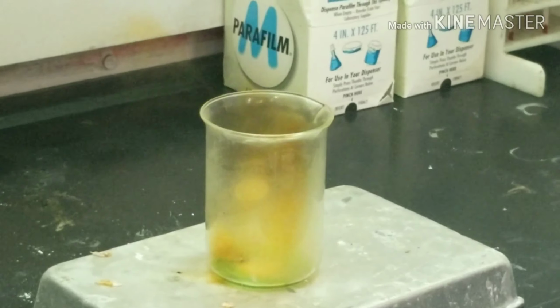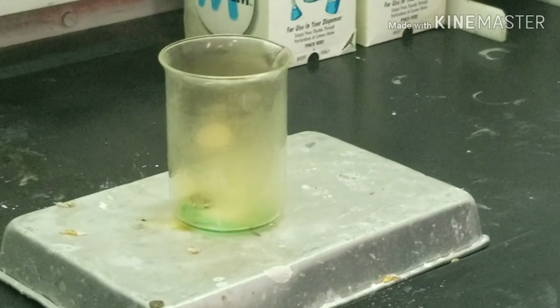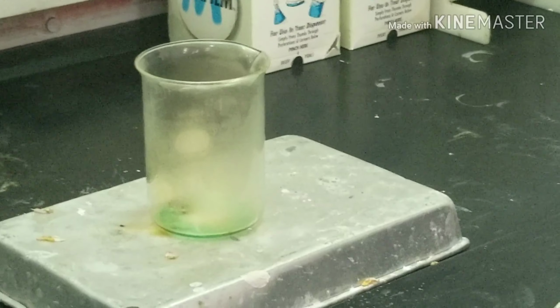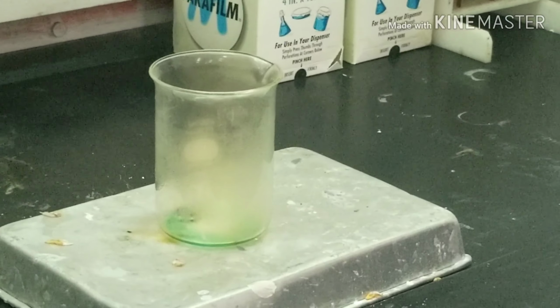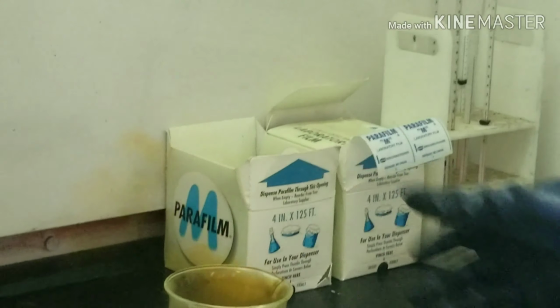Certainly still reacting a little bit. We'll wait just a little bit longer. If I tilt this a little bit, you can see that bluish, greenish color right there. It's starting to react a little bit more, coming in contact a little bit more.